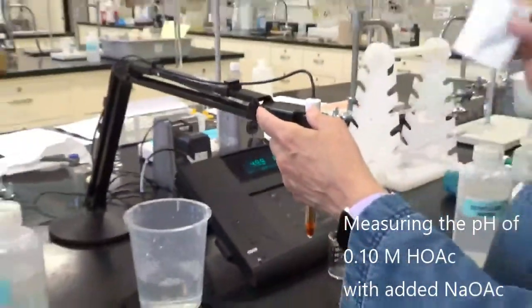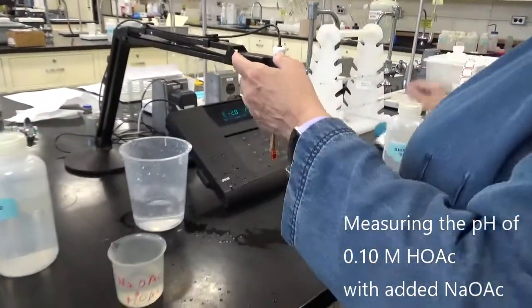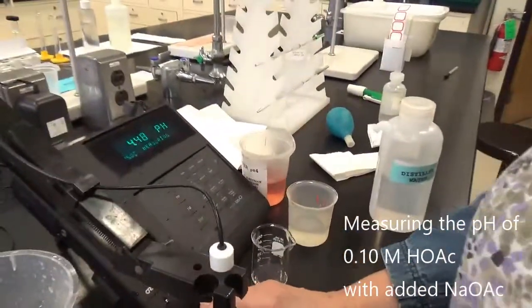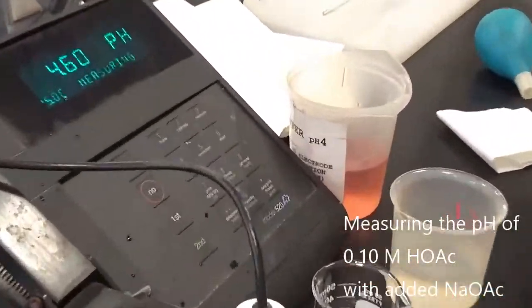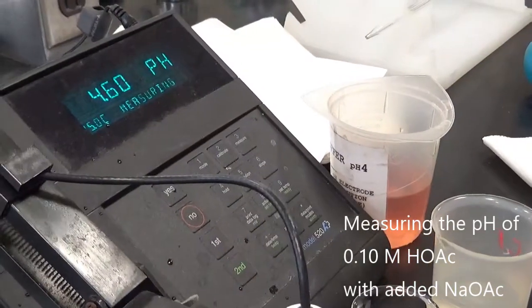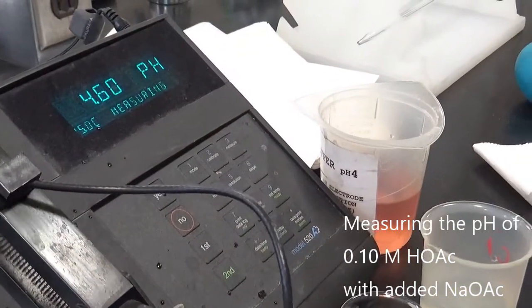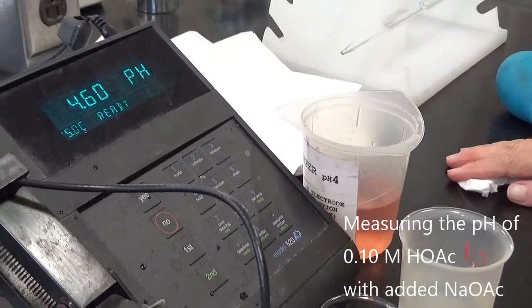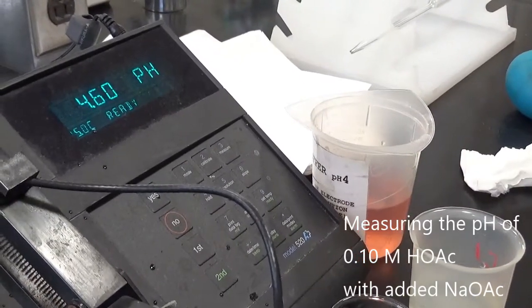Okay, and now I'm ready to measure the solution with the acetic acid and the sodium acetate. The sodium acetate with the acetic acid is 4.60.